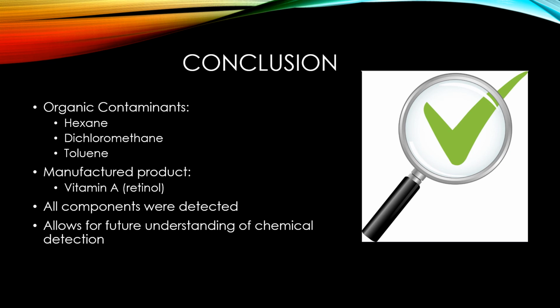But what this experiment does show is it allows further understanding of chemical detection, such as this could also be seen in a crime scene. If an unknown liquid is at the scene, this could then be sent to a scientist, and they can then run these tests that were explained to try to determine what that would be.